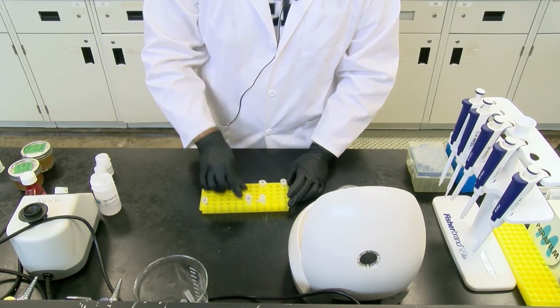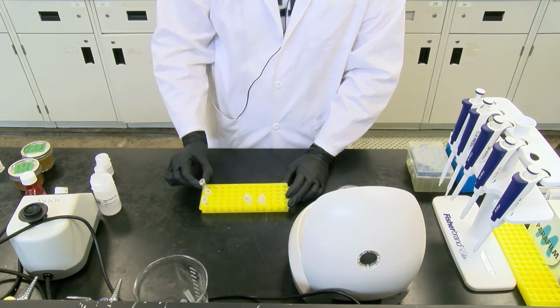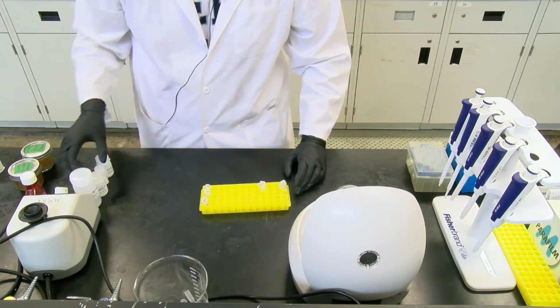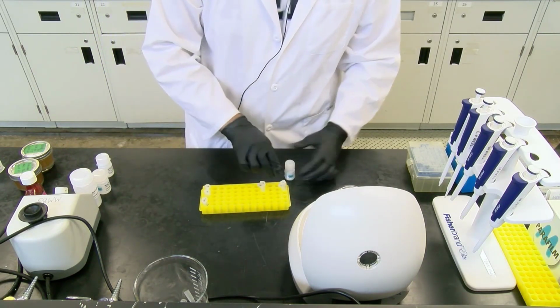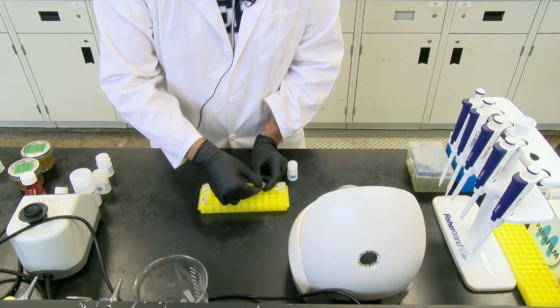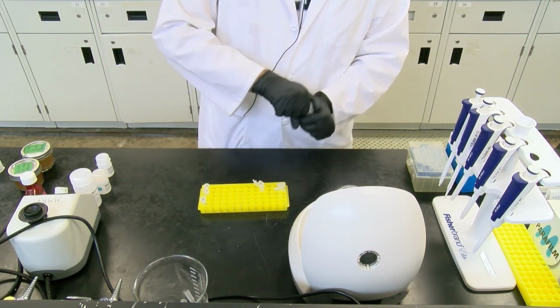And now what we're going to do is we're going to elute our DNA. So these are our old sample tubes we don't need. And now we're going to use elution buffer. We're going to use 100 microliters of the elution buffer over here. And we're going to want to try to put this at the center of the membrane. The reason being is we're going to leave this to incubate in the center for 2 minutes, so we want all of it to be in the center over here.